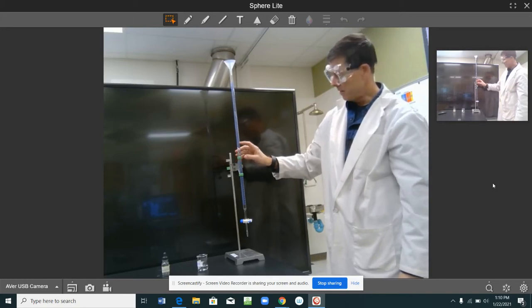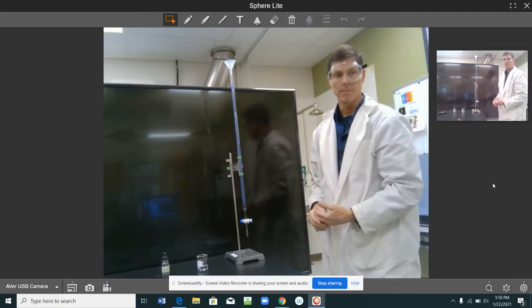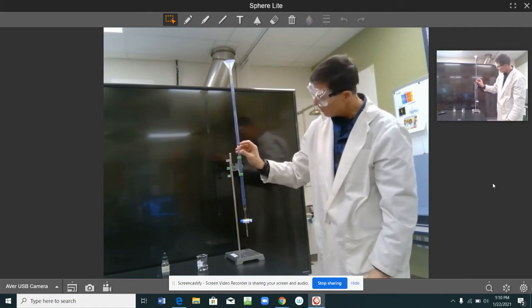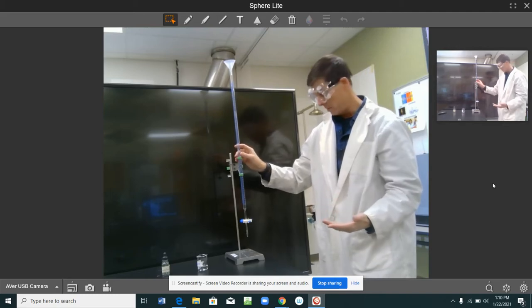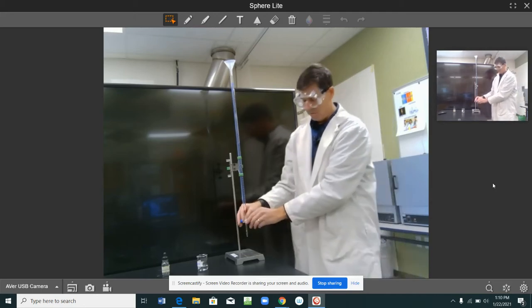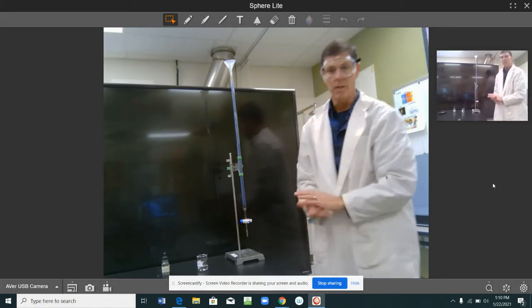Okay. Now, normally what happens is this is where you put a liquid of an unknown concentration. Okay. And the numbers are milliliters. And we've got 10 tick marks between, so we can actually measure a tenth of a milliliter. Very small value. Down here, as we turn this device, this is what actually lets the liquid out. Flat, perpendicular is off. When it's parallel, it's on. When you go partway there, you're going to have different levels.